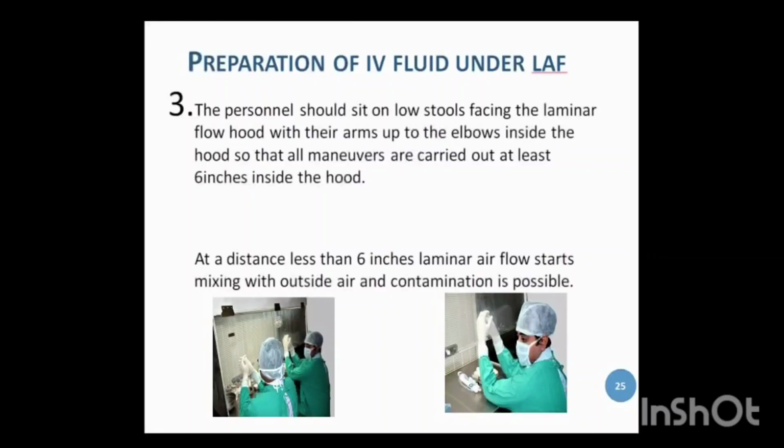For step number 3, the personnel should sit on a low stool facing the laminar airflow hood with their arms up to the elbows inside the hood so that all the maneuvers they are carrying out are at least 6 inches inside the hood. At a distance less than 6 inches, the laminar airflow starts mixing with the outside air and contamination is likely.